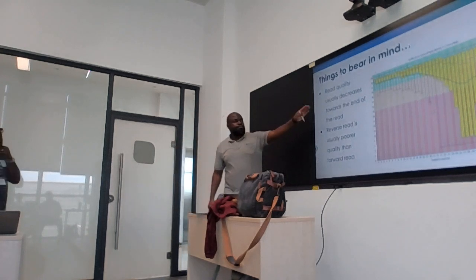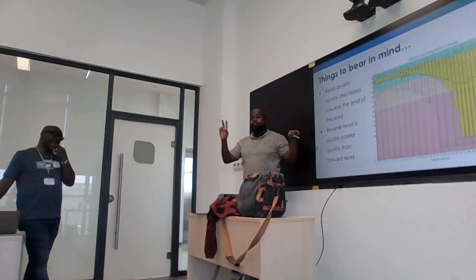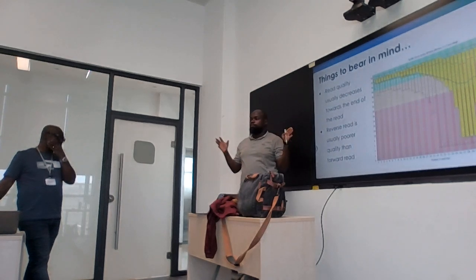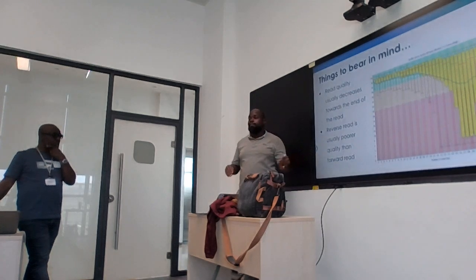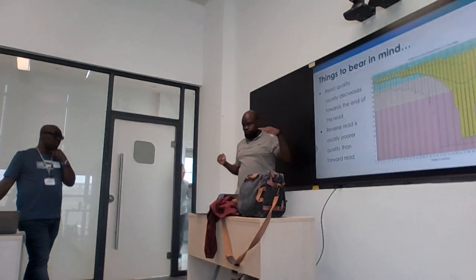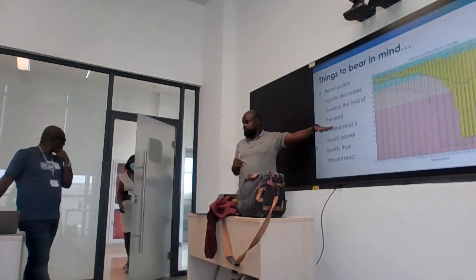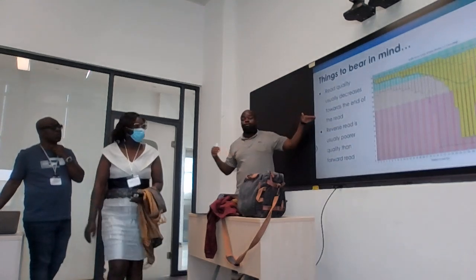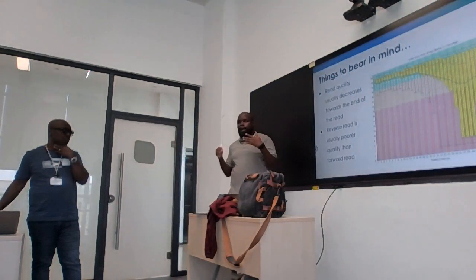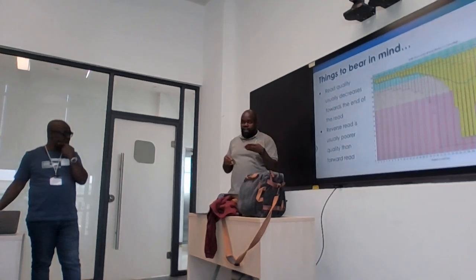So we've talked about this. We've said usually towards the end, the read quality is lower. And also secondly, because, you know, we typically do paired end reads, right? Forward and reverse. The reverse read is generally usually of lower quality than the forward. Again, it just goes back to the physics of how the sequencing works, right? So expect that your reverse reads will be of lower quality than the forward. Okay? Now, we talked about looking at the Q value, looking at the minimum length.